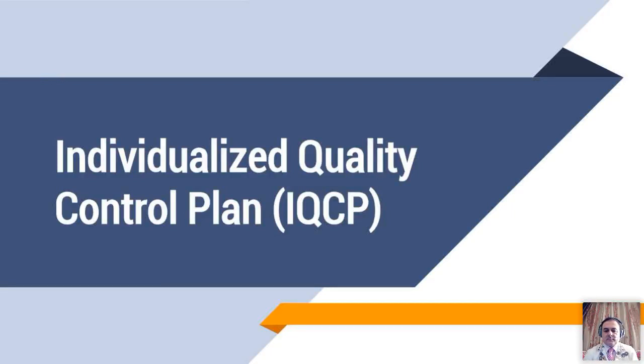The lecture today, I chose its title carefully: Individualized Quality Control Plan, IQCP. A new topic. This is a new requirement being introduced into the CAP checklist, all common checklists since 2016. It was one of the mandatory requirements as applicable.